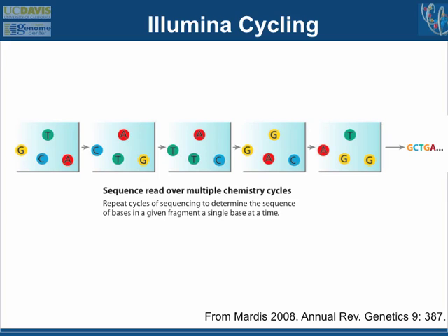You then run multiple cycles of this sequencing by synthesis reaction and watch with the sort of video microscope as the different colors come in different regions of the slide where these clusters are. And then there's a lot of informatics that has to figure out where a cluster actually is. I think it iterates over the first few cycles to figure out where the clusters are and then can focus in on those regions.